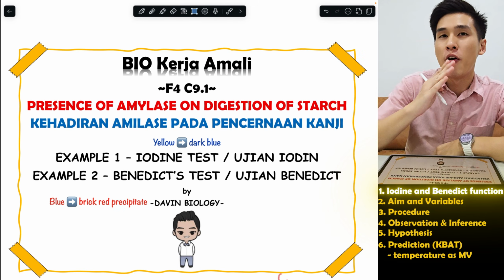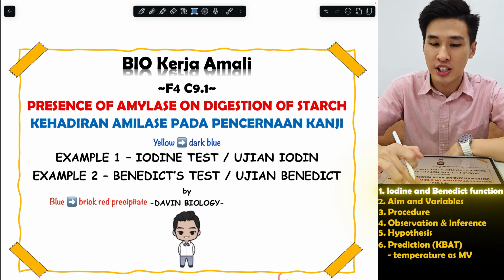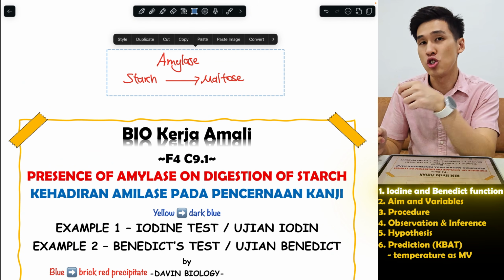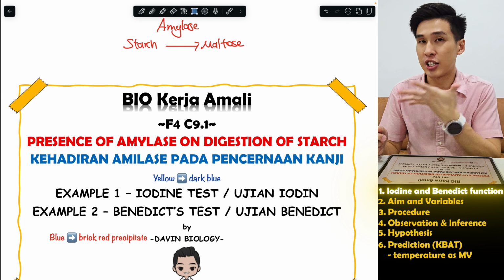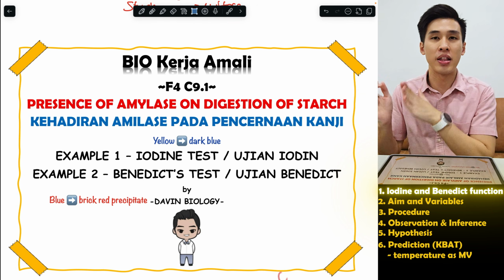Now, in this video, we're going to talk about Form 4 Chapter 9.1 Bio practical: presence of amylase on the digestion of starch. First, of course, you need to know amylase is the enzyme that digests starch into maltose. Now, by the end of the experiment, how am I going to know whether starch is being digested? There are actually two tests that you can carry out: iodine test and Benedict's test.